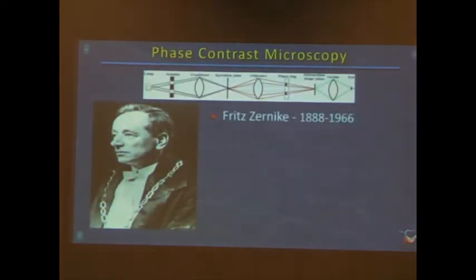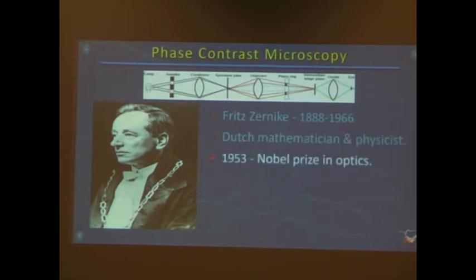I am not going to bore you with this part, except to tell you that it exists in your notes here. I am a total nerd, and I find these things utterly fascinating, but I know most people don't, but it's there for you if you want it, exactly what phase contrast is and how it works. In effect, summarizing very quickly, it's a way of optically staining samples.